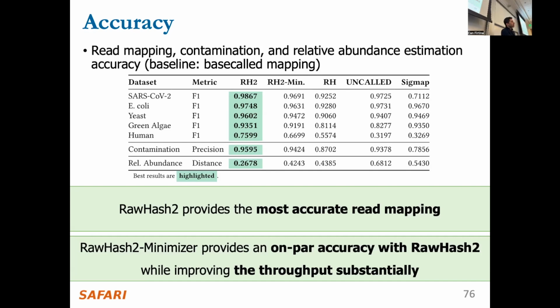To make it better, I think better filtering algorithms need to be developed, so that even if you have too many seed matches, specifically from repetitive regions, which I believe is where it's coming from, they can be filtered better when we're hitting the repetitive regions.